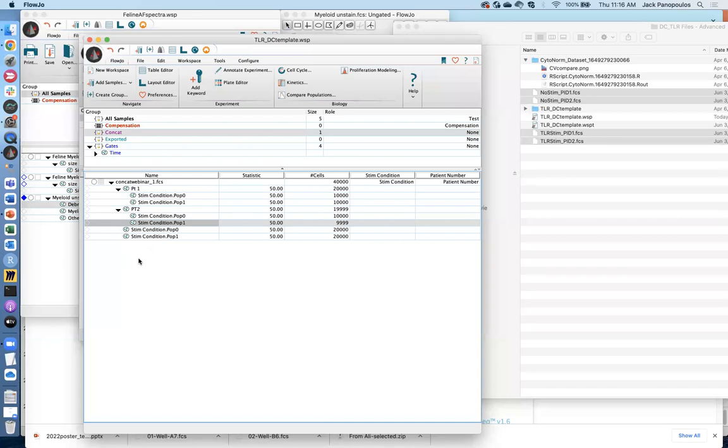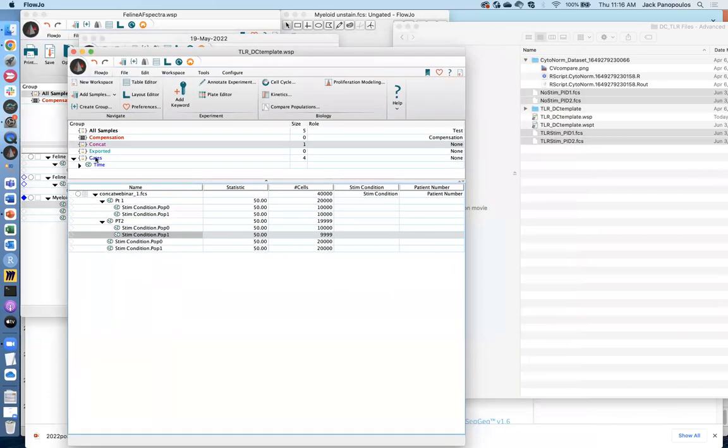When to use compensated or uncompensated when concatenating populations? Great question. You guys saw me here.